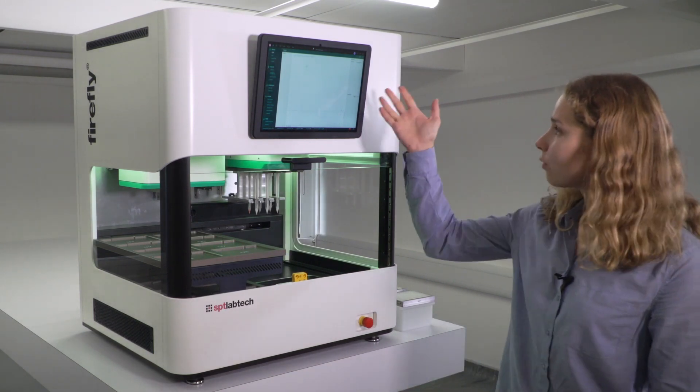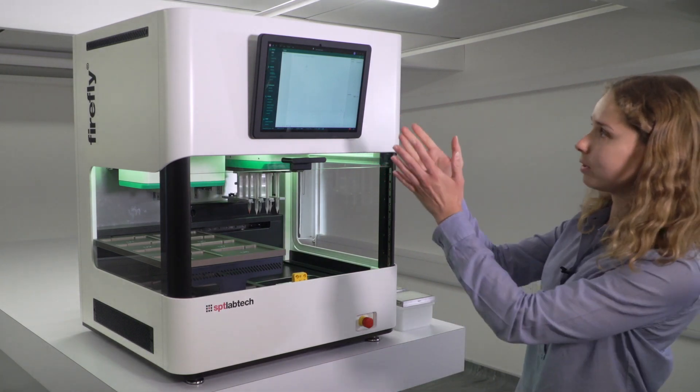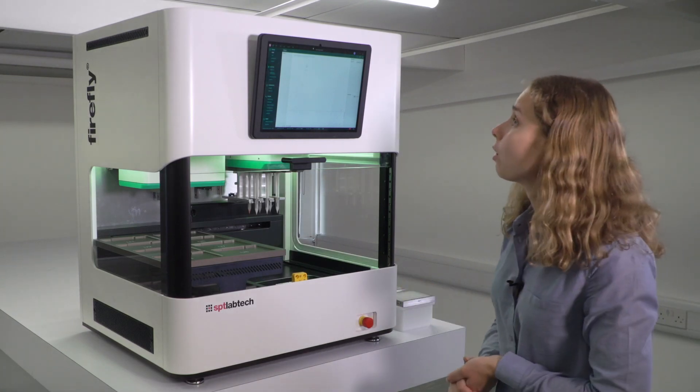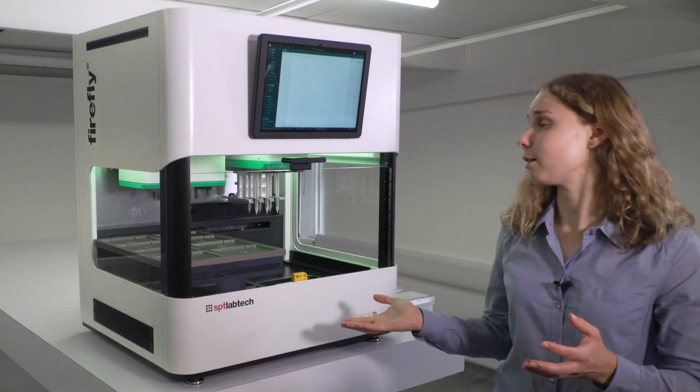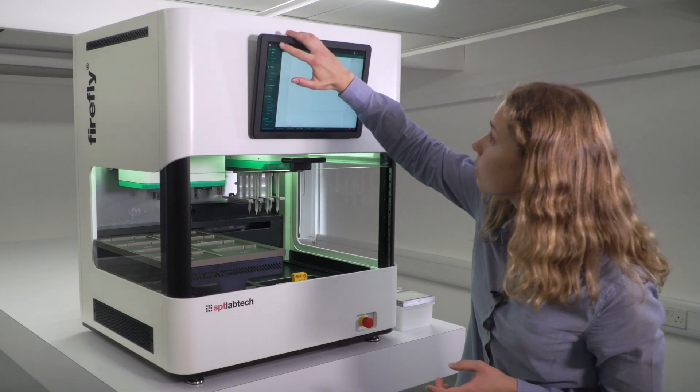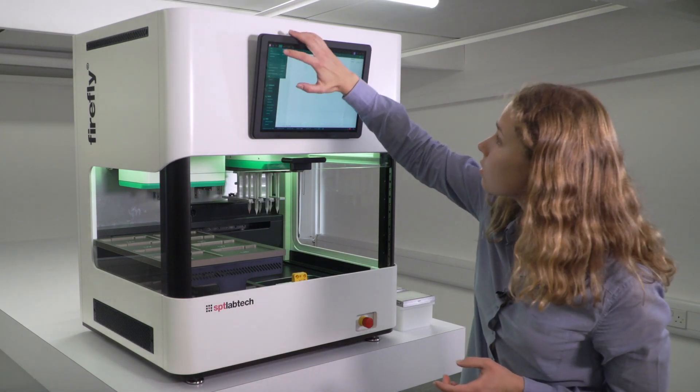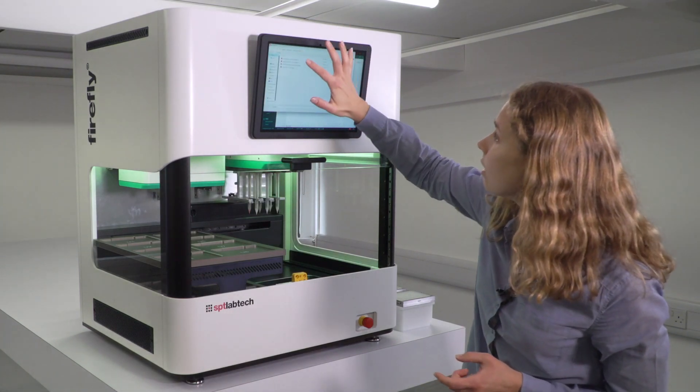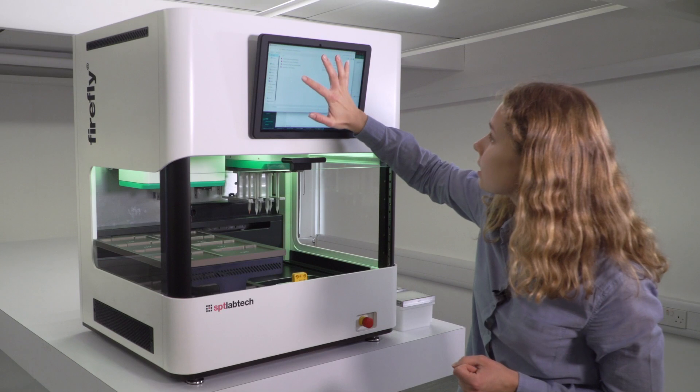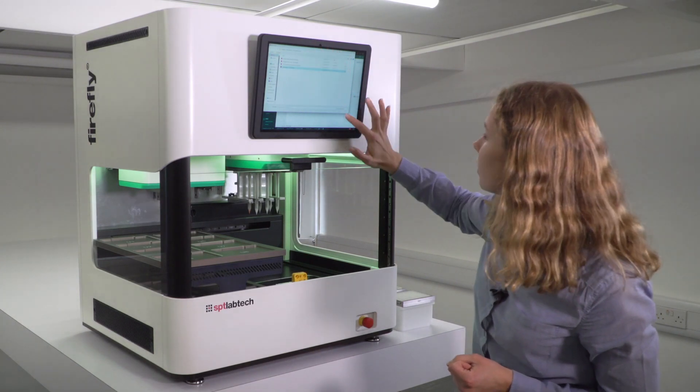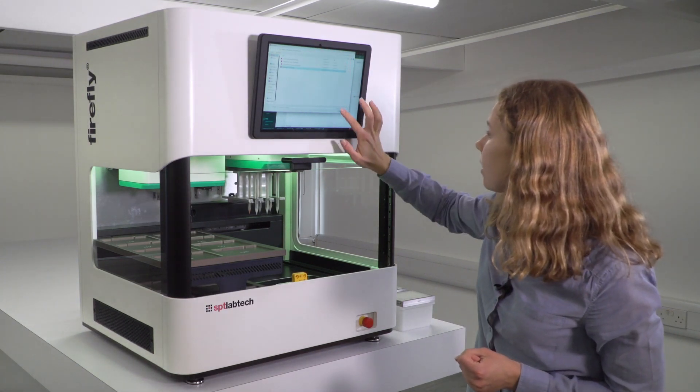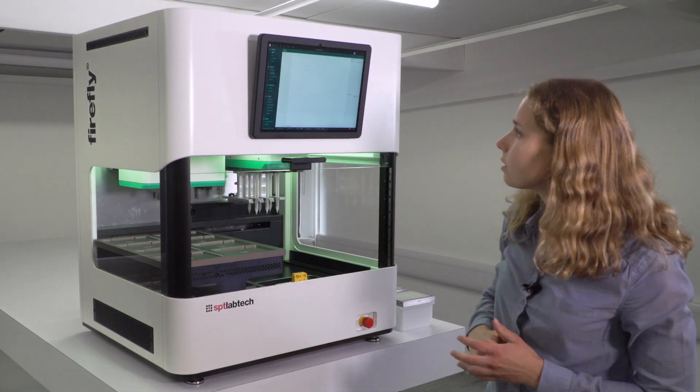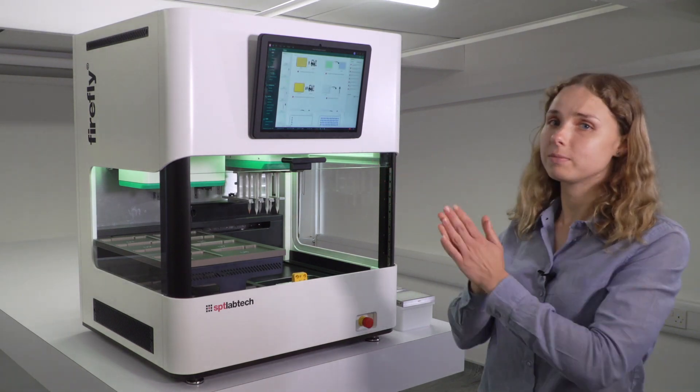So first of all, the software is open at the moment, it's ready to go. I will just need to load the protocol that I've previously written, and to do that, I can just open the protocol and select the one that I want. Here it is. And after it opens, it will load here.